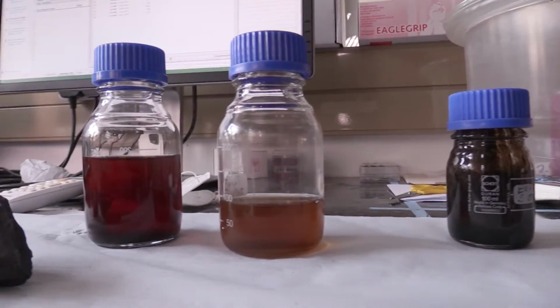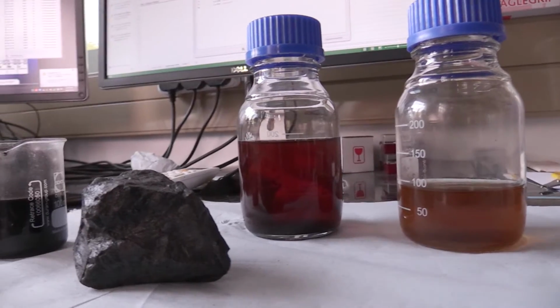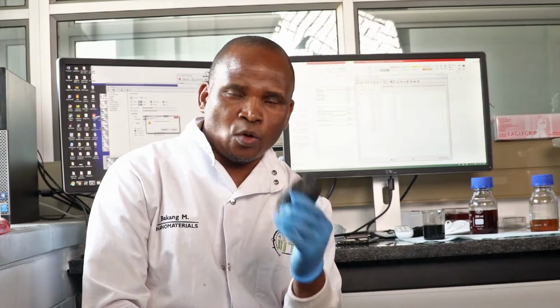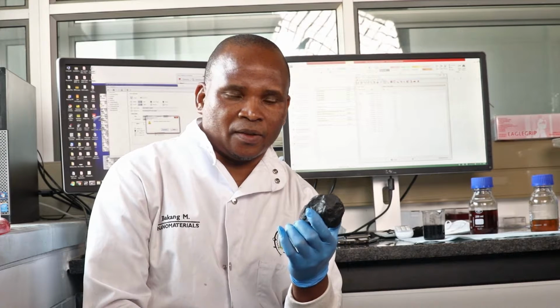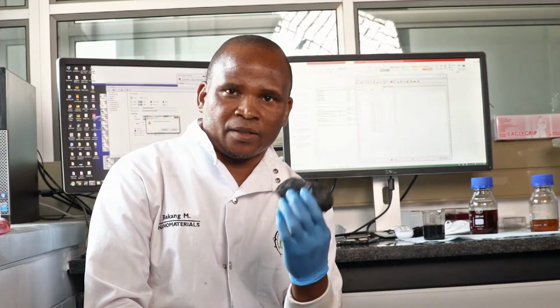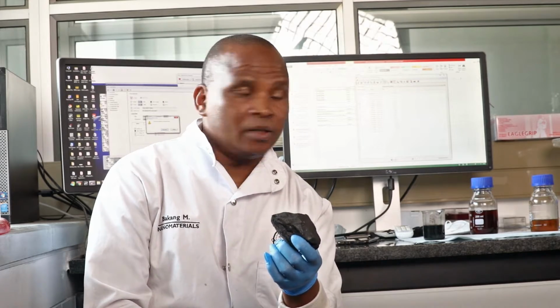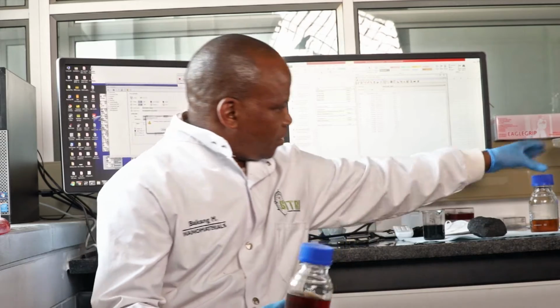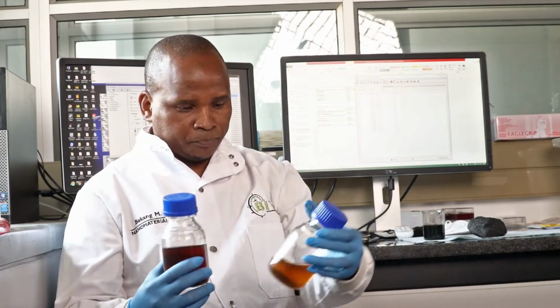So as you can see behind me here, I have various types of materials. Some of those materials that I have, like you can see here, this is coal. And we have a project that deals with coal to liquid. Coal is processed to give various types of chemicals from it. And as you can see in these sample vials here, these are the various byproducts of coal.